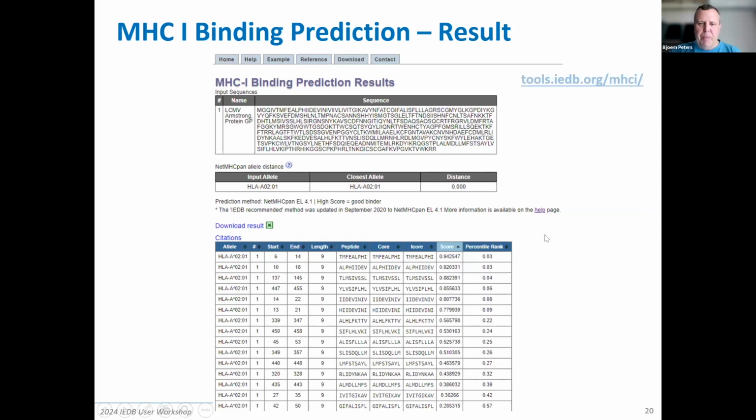And you essentially have a row per peptide and a predicted score. In this case, this is choosing the MHC EL 4.1 method, where the score is similar to a probability of the peptide to be presented. And here, the higher scores, the better. That is always told here. If it's nanomolars as an output value, then the lower is the better.